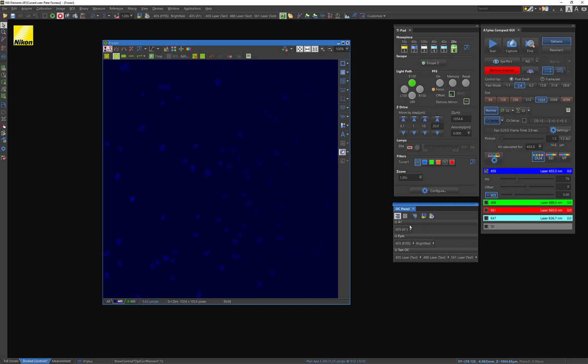Additionally, you may do what I've done here, where for the A1 confocal imaging, I'd have a set of presets or optical configurations versus just looking with the eye, so with epifluorescence on the confocal. So you can separate them that way. They're very good ways of organizing so that instead of having to sit down at your microscope computer and trying to figure out which settings would go best, or just trying to figure out how to visualize something with the confocal, instead of going through all the steps of making those settings, you can just click a button.